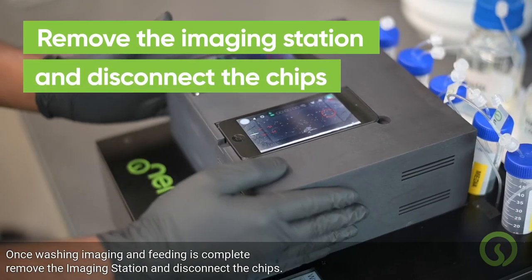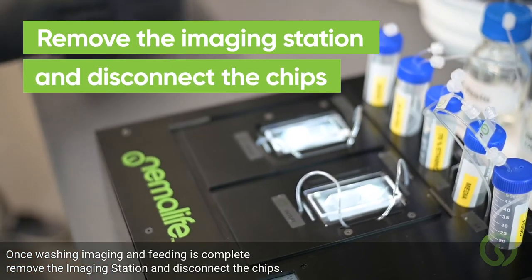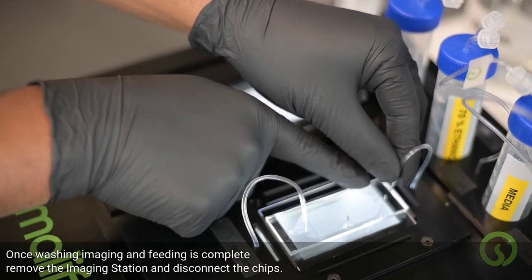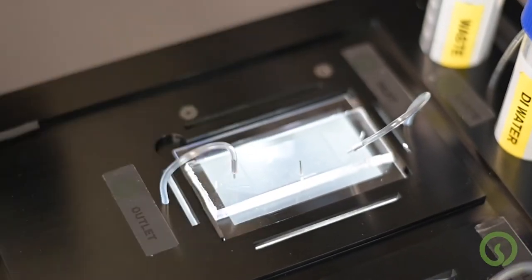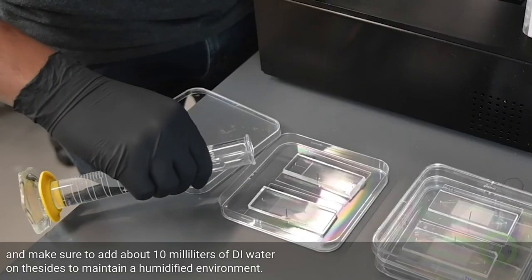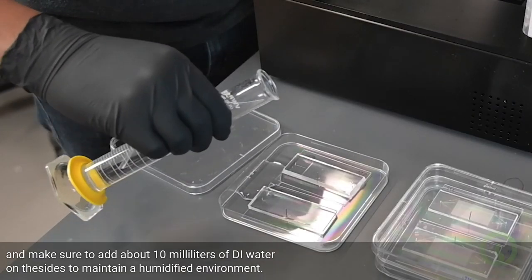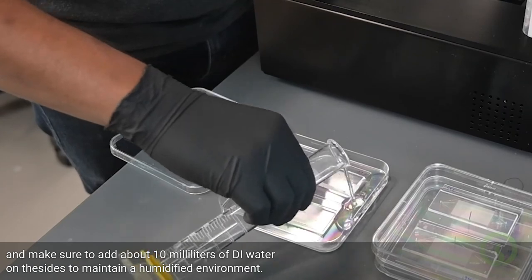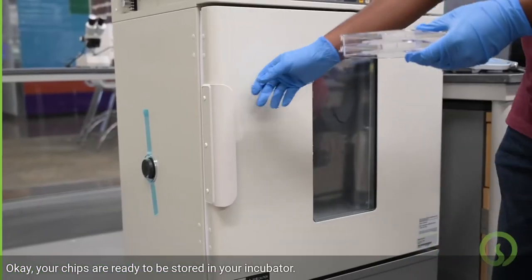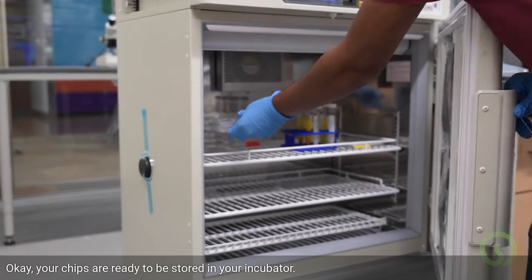Once washing, imaging, and feeding is complete, remove the imaging station and disconnect the chips. Put the chips in a Petri dish and make sure to add about 10ml of DI water on the sides to maintain a humidified environment. Do not forget to add water to the Petri dish once every 3–4 days to prevent them from drying out. Your chips are ready to be stored in your incubator.